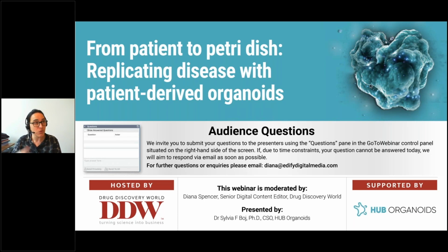So in this sense, if you think about the development of a compound for which you are doing some molecule development, with primary cells, you are always testing one time on different patients where you can have different responses because patients are heterogeneous and they have a heterogeneous response. So with the organoids, we can represent all these patients and have these patients available along all the process of drug development, to keep developing and comparing, going from hit to lead and developing your compound further.